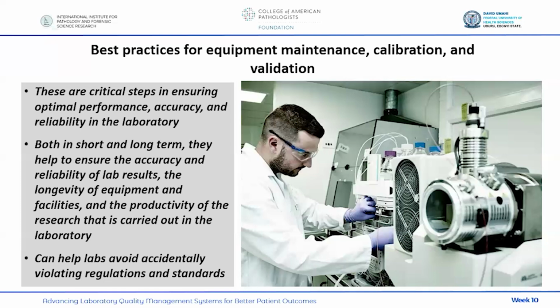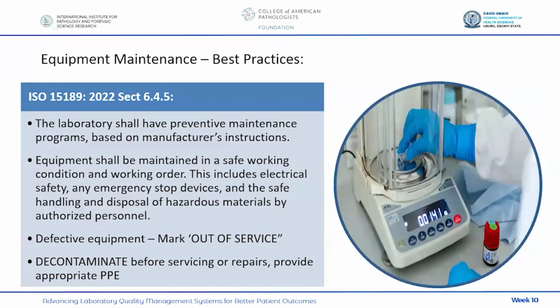And not only that, they prolong the life of your equipment and of your facilities, and even promote the reliability and productivity of the research carried out in your laboratories. And when you stick to regular equipment maintenance, it can help you to avoid violating regulations and standards. When you're doing the correct thing, the right thing, as and when due, you will most likely not violate any regulations and standards. Okay.